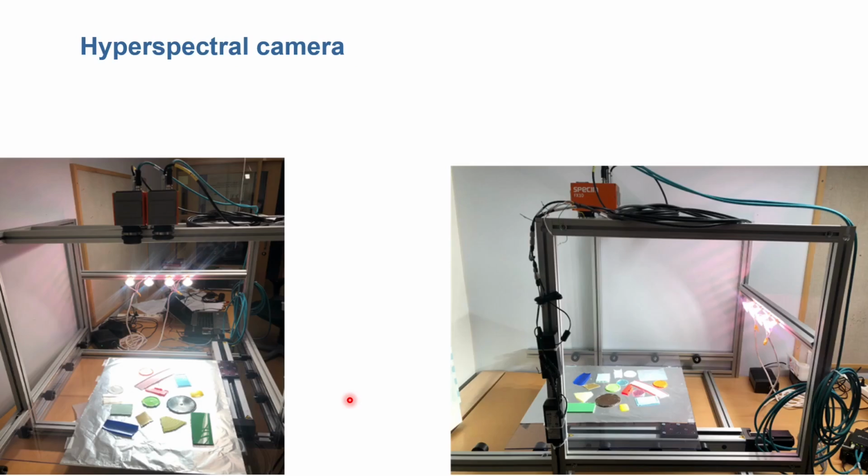One such contactless method for measurements is the use of hyperspectral cameras. You can think of a hyperspectral camera as a color camera that has hundreds of spectral channels for each one of the pixels. The camera can also be made sensitive in the infrared region, such that those hundreds of spectral channels can be used to implement vibrational spectroscopy at every pixel.